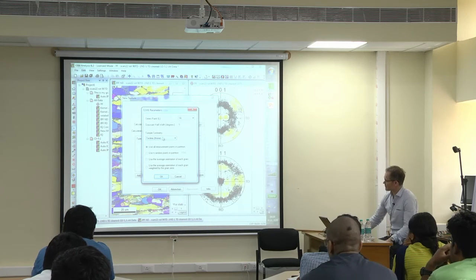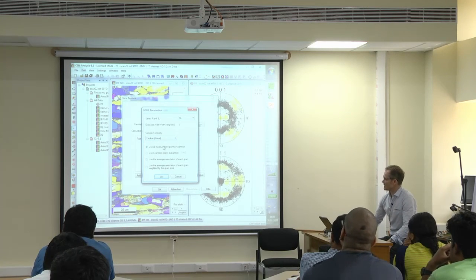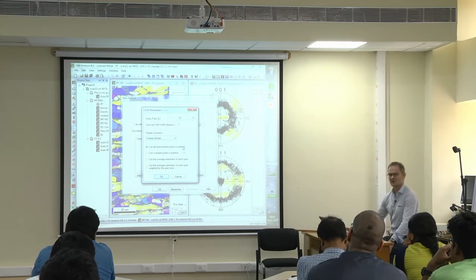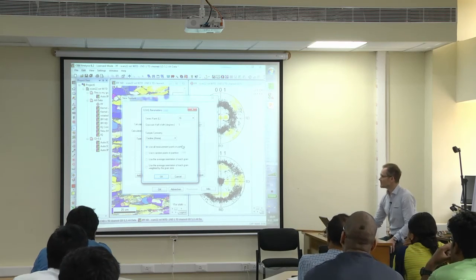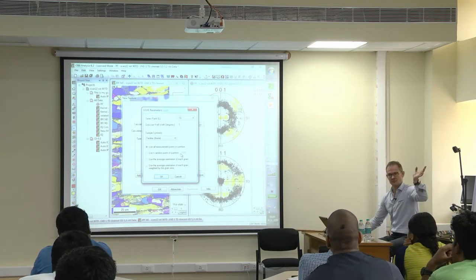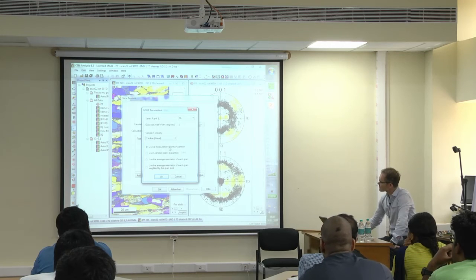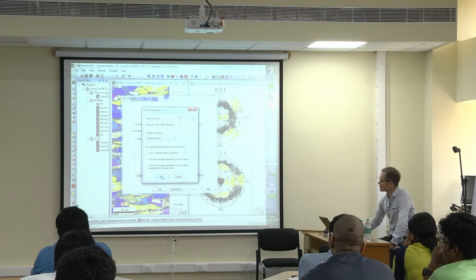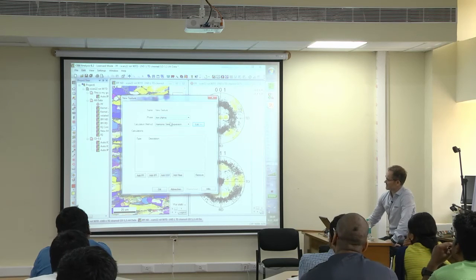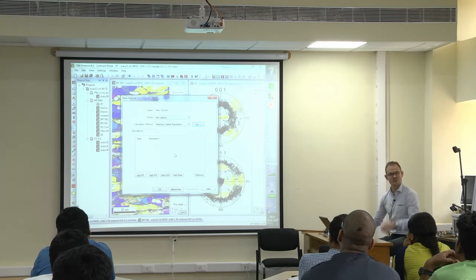Okay, but let's keep with triclinic, and yes, say use all measurement points in statistics. Then it calculates a little longer. But you can say also use only 1,000 points, then it's ready in a split second. But for the moment, let's try it once with all. Okay, we calculate that.